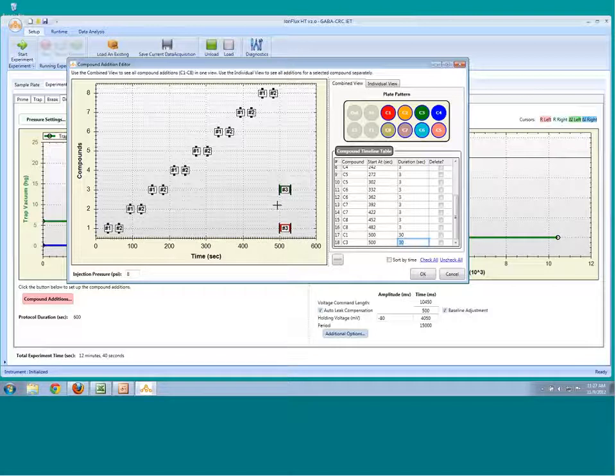And we can use this to great advantage for systems that are complicated. So a system like the NMDA receptor, which is very sensitive to glycine and glutamate that's being released from neighboring cells, we can actually protect our recordings from that ambient material by choosing a compound well and putting clean buffer that would then protect the recording from what's going on. And this is extremely useful for systems like the NMDA receptor or the purinergic receptors, which are activated by ATP.